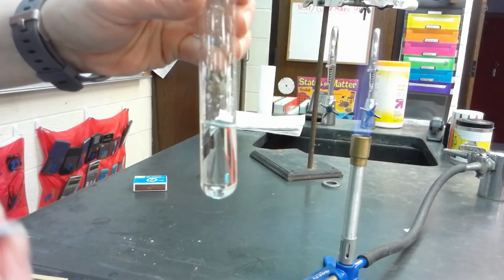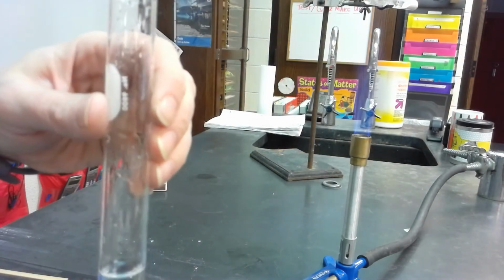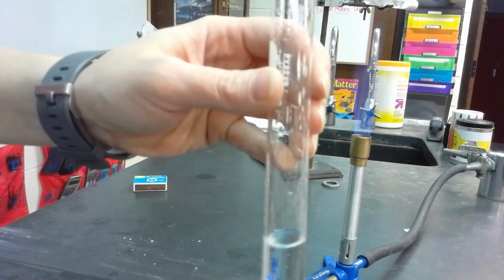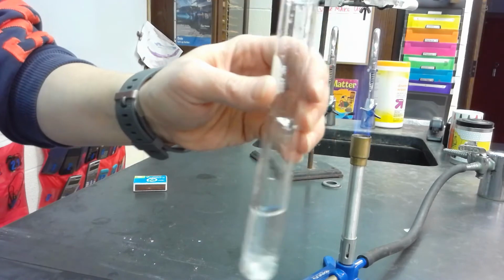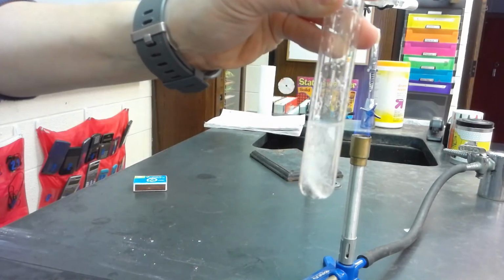I'm going to take this little piece of zinc and put it in the test tube, and then I'm going to quickly cover it with a note card, because if I'm going to test the gas that's being produced to figure out what it is, I have to trap the gas inside. So it's going to take a little bit of finagling, because usually you have a lab partner to help you with this part, and I don't have a lab partner today. So here we go. We're going to put the zinc in the test tube. We're going to cover it with the note card, and hopefully you can see this on the camera.